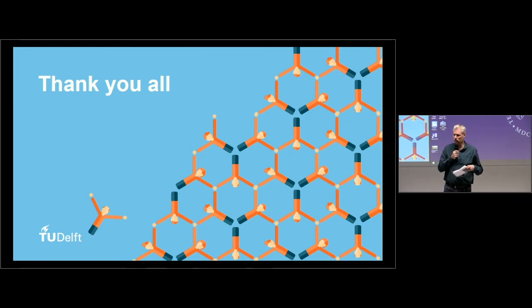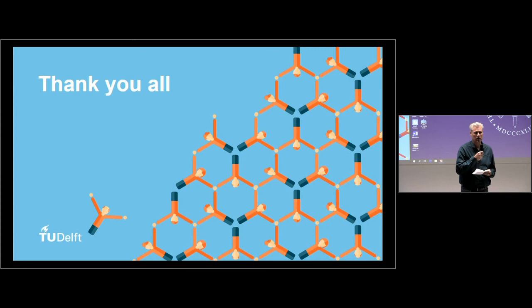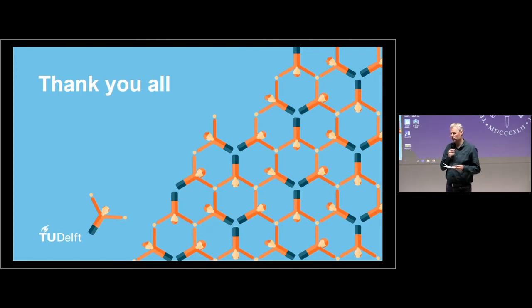For example, these movies that we make to produce super resolution microscopy images are tens of gigabytes. In essence, they contain very little useful information, and only a set of coordinates of molecules that we localize in these images are the actually really relevant data. So that's also something to think about.